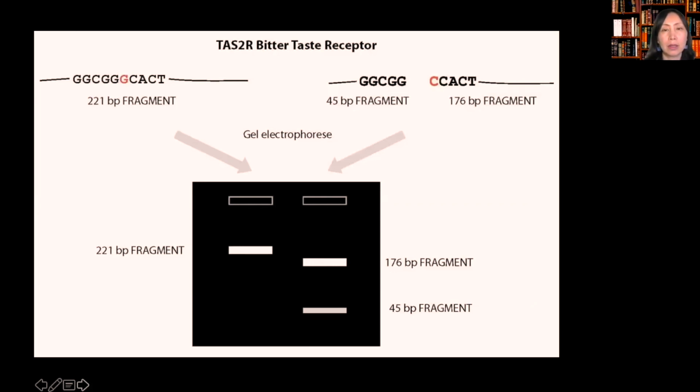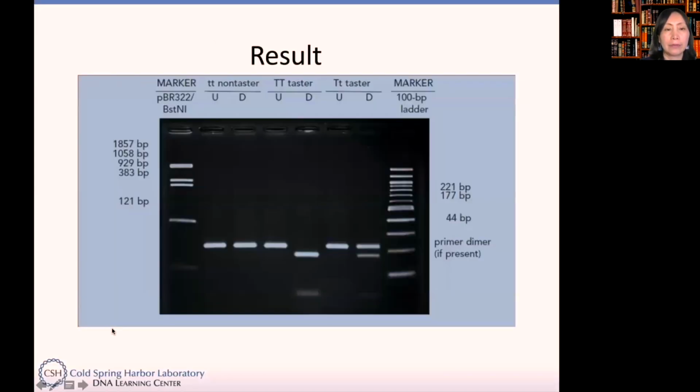As a reminder here, if you are a taster, then your gene has GGCC in the sequence. It could be recognized and cut by the HaeIII enzyme. Here is a picture from a previous experiment. 3 students participated here.